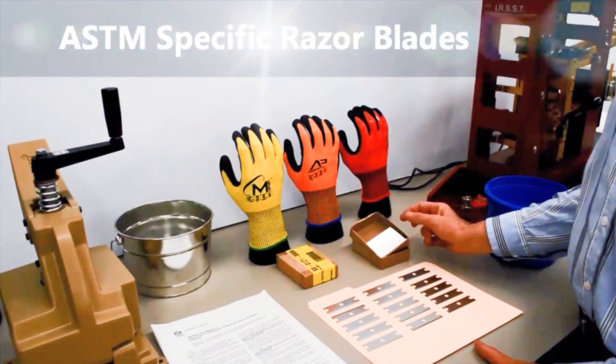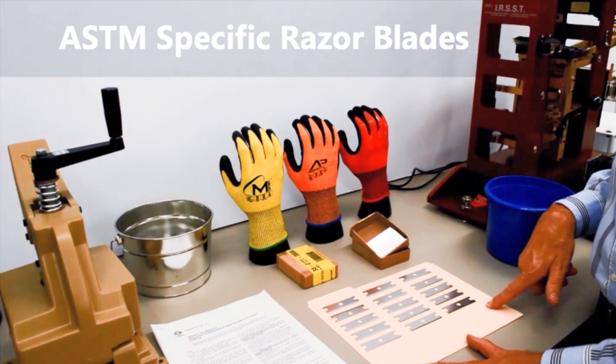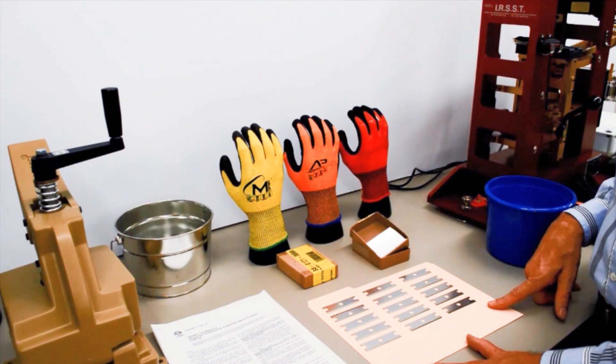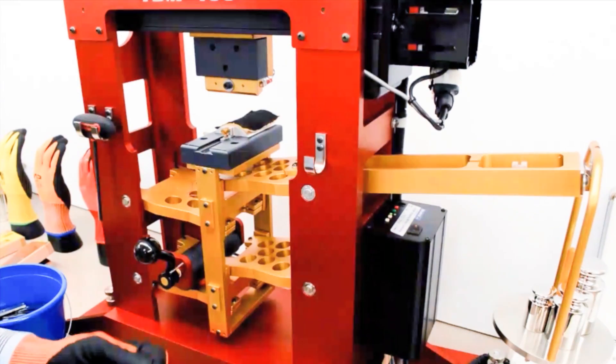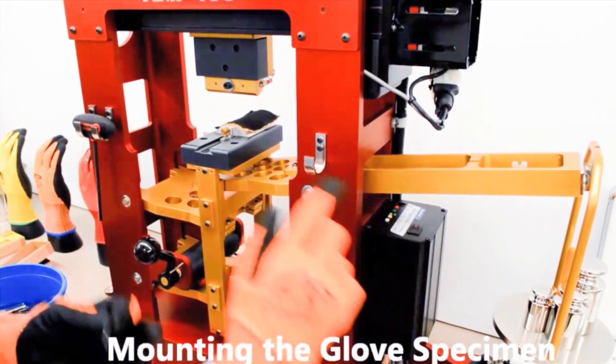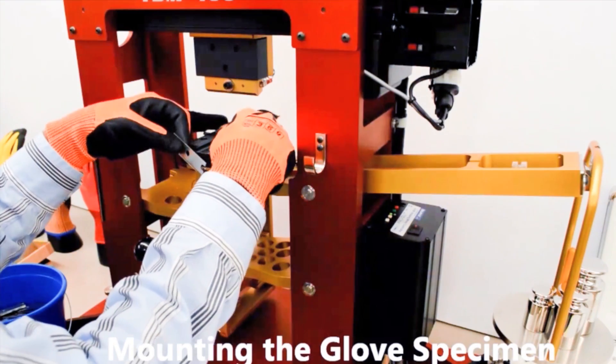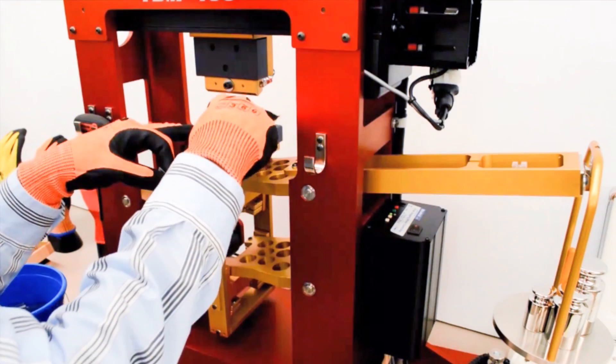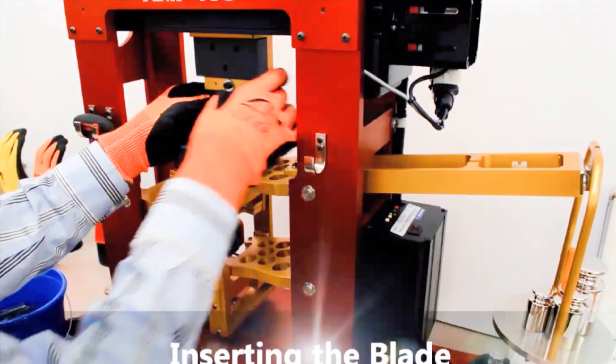For the ASTM method, a specific style of razor blade is used, and it takes 15 different razor blades to perform one ASTM cut resistance testing. On the TDM100, the first step that we take is we mount the test material. This is the yellow glove, and it's mounted onto the mandrel with the copper strip on it, and then we place the razor blade above it in the holder.